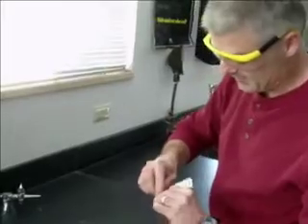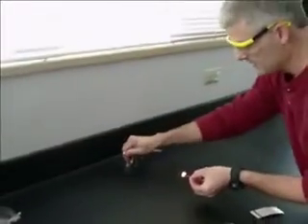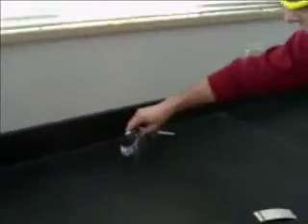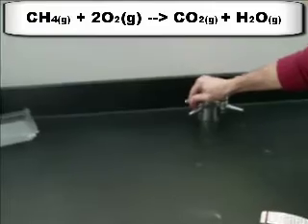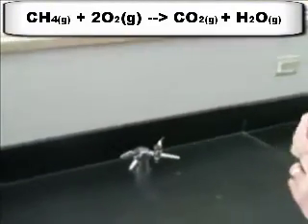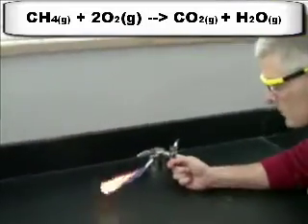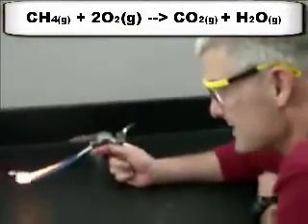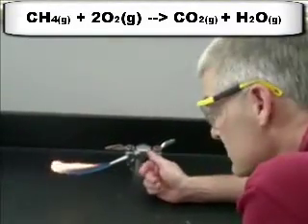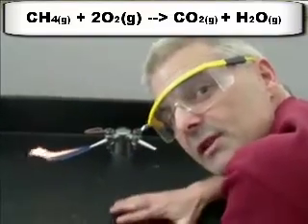So I'm going to light a match. I don't have a lighter, but I could use a lighter too. It doesn't matter. And I can go like that. And guess what? I can essentially make a flamethrower. Oh, it went out. It's just too much. Now, an interesting thing about this is right here, we're producing the gas. Why didn't it blow up the pipes? Because it's pressure coming out. Well, it's pressure coming out, and also in the pipes themselves, there is no oxygen. The oxygen's only in this room.